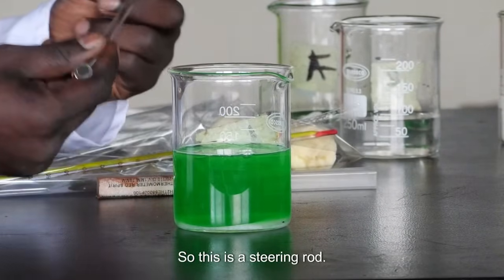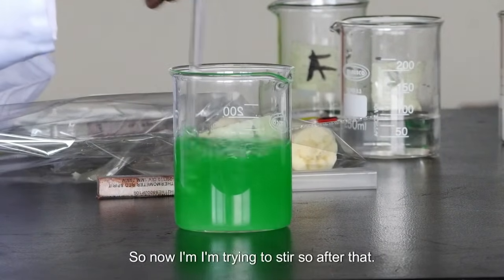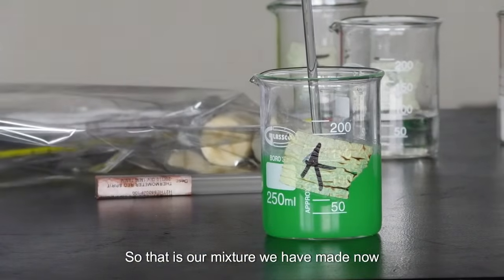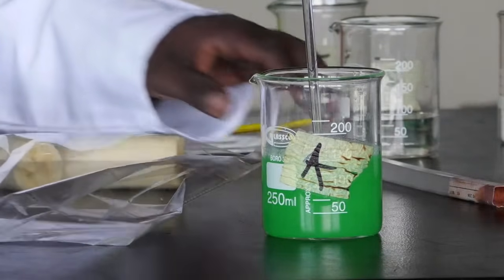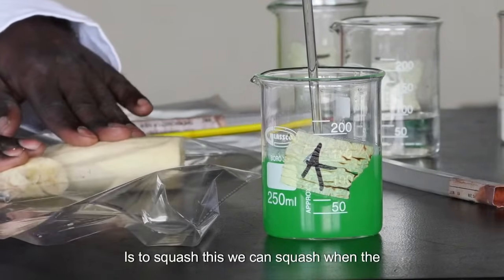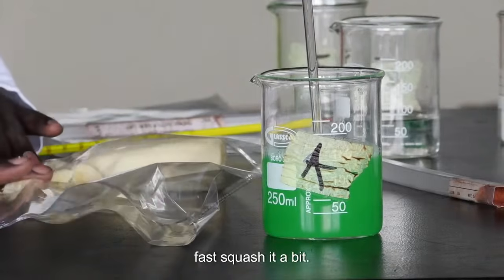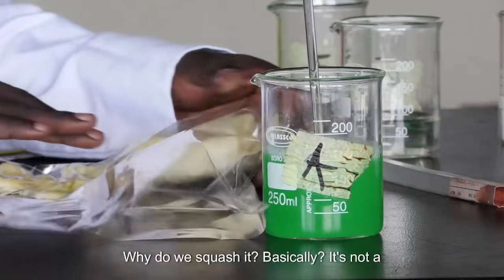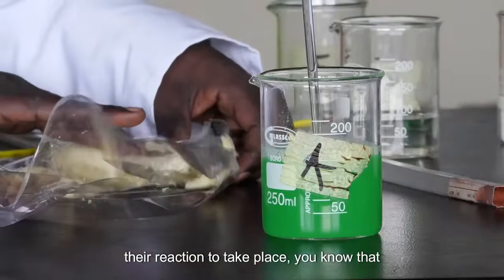So this is a stirring rod. If you don't have one, you can use a spoon. So now I'm trying to stir. After that, that is our mixture we have made. Now what we need to do is squash this. We can squash when the liquid is already in there, or first squash it a bit. Why do we squash it? It's just to increase the surface area for the reaction to take place.